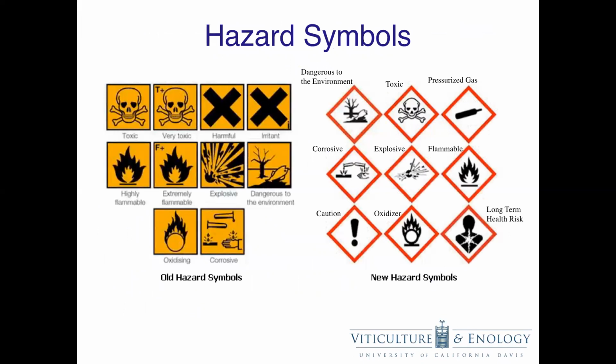These hazard codes are also associated with hazard symbols. You will see these symbols on the chemical bottles. Each symbol depicts a hazard associated with the chemical.